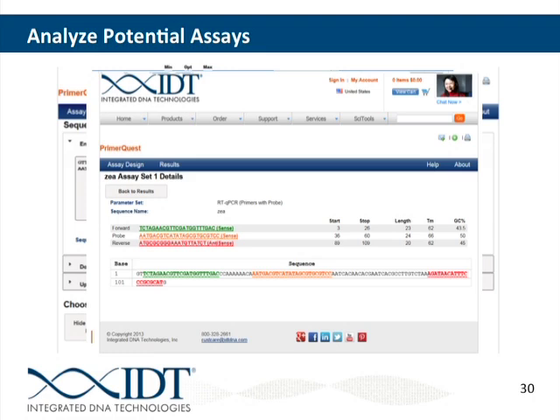So if you're looking to target a really specific region, then you've got to minimize that sequence. But if there was a lot of difference between the two sequences, like in that first example where we gave it that whole big chunk of 3' end that was different, that's the ideal situation where you can give it a lot of sequence context to work with, and then PrimerQuest will come up with more designs to choose from and higher scoring designs.